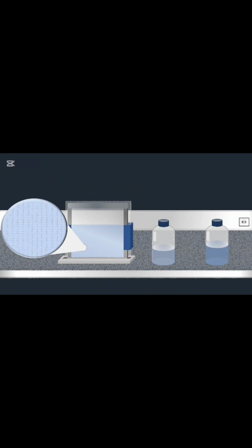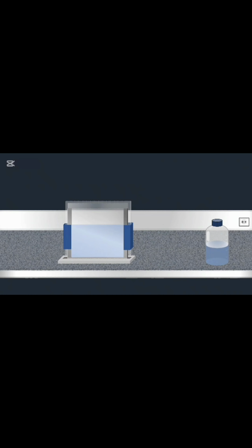The pore size of the gel is related to the ratio of acrylamide to bisacrylamide. Low concentration is preferred for high molecular weight samples. The stacking gel solution is poured on top of the solid separating gel, and the plastic comb is placed on top of the stacking gel during polymerization, enabling the formation of small wells in the gel.